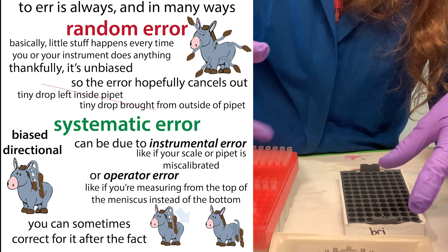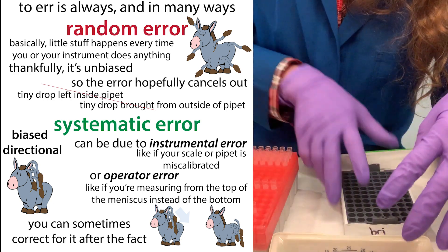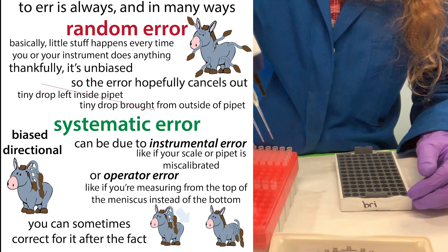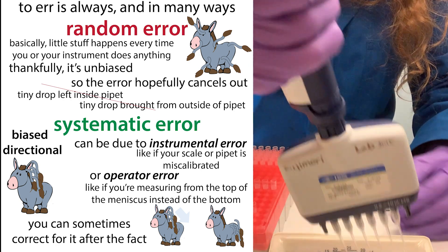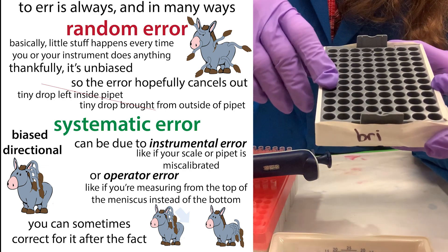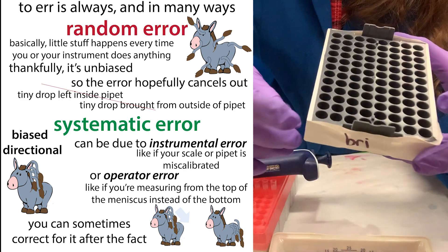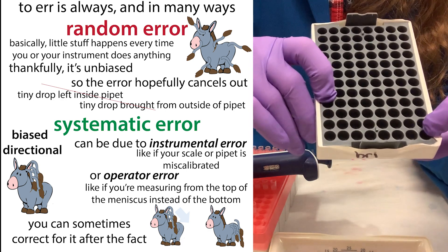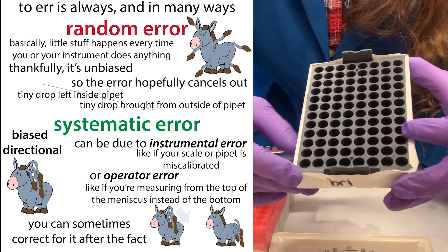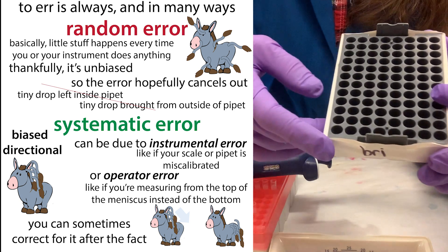Uneven pipetting can mess up your experimental results in a systematic error way — meaning the same problem might occur in the same wells every time. For example, if when you picked up tips you tended to apply stronger pressure on your right side, the sample level will consistently be higher on that side than the other. Say every time in your experiment sample E is on one side and sample A is on the other — sample E will consistently receive more volume, making it seem like it's higher expressing when really you just pipetted more. This is one reason why it's good to rotate your samples if you're doing replicates.